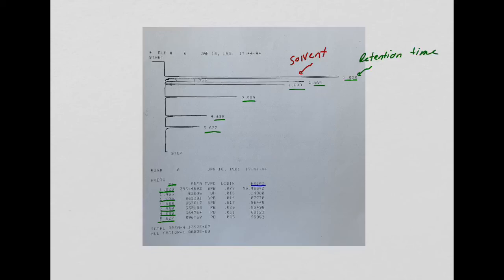Now also, based on this, whatever mixture it was that I took a GC of, you can say there are 1, 2, 3, 4, 5 compounds in that mixture, right? There are 5 compounds in that mixture. All right, beautiful. Nice job. Again, there is a correction factor that you have to apply, but we will talk about that later.